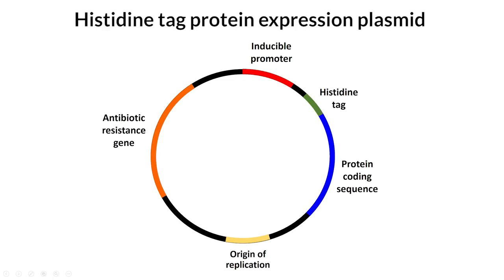Here I have a plasmid that I'm going to transform into my protein production strain C41. Plasmids are circular pieces of DNA which we use to transfer the instructions for the synthesis of our protein into a bacterial cell.